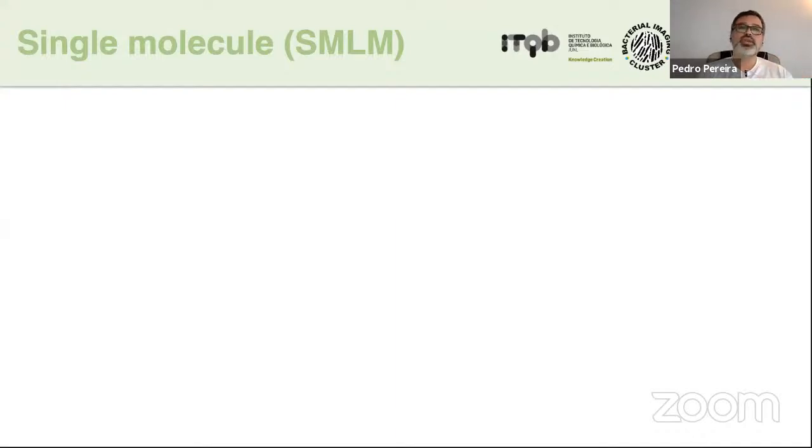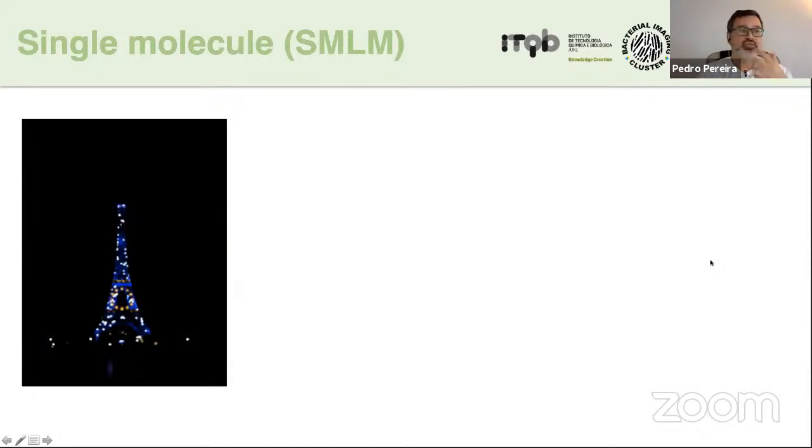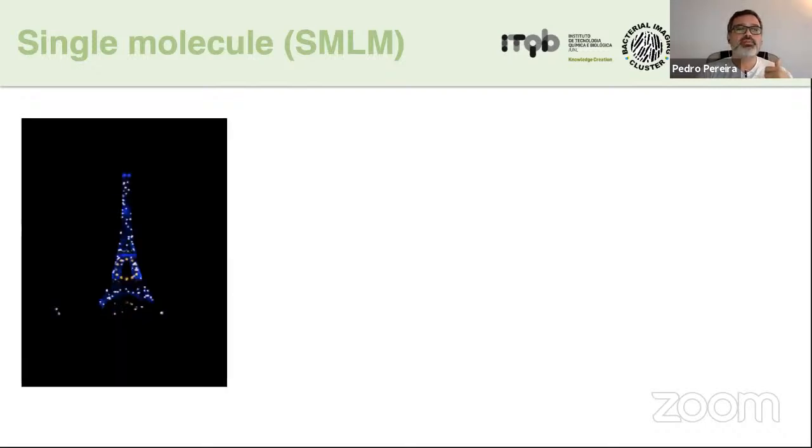It does not have to be a biological sample. The concept is sound for any blinking movie. And for this, I want to steal a movie from Ricard that he took in Paris, which is the Eiffel Tower blinking. So as you can see, this is a macro structure which is blinking.